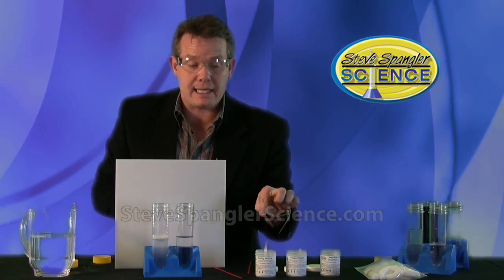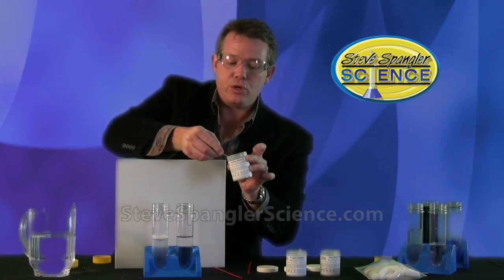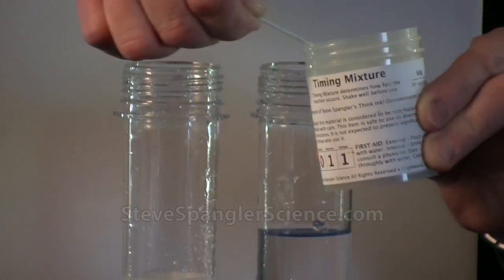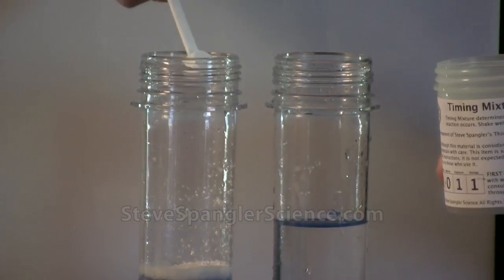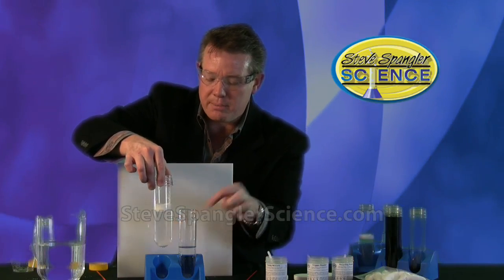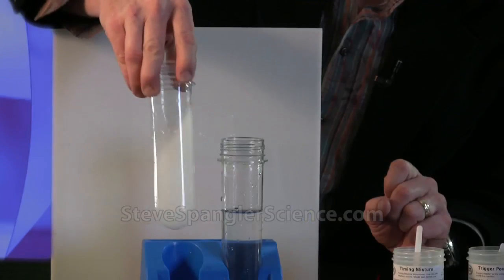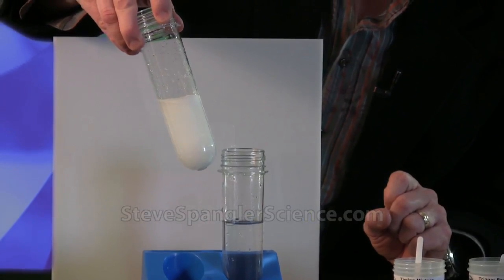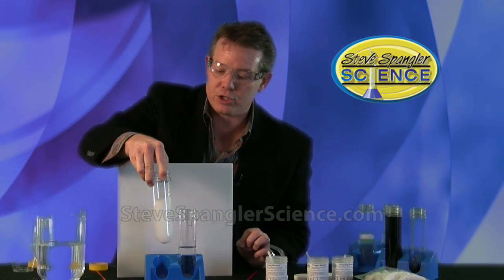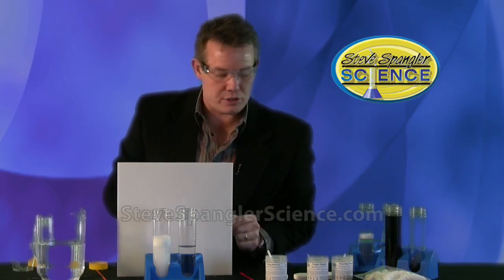To test tube A we're going to add timing powder. Make sure you mix up the powder before you start — you'll need two scoops. There's the first scoop and the second scoop. Now don't put the cap back on, because if you look closely you can see the bubbling going on. That bubbling is producing carbon dioxide gas and we want to make sure we don't build up pressure and throw liquid out of the test tube. Just a gentle stirring with the stirring sticks included in the kit — that's all you have to do for test tube A.